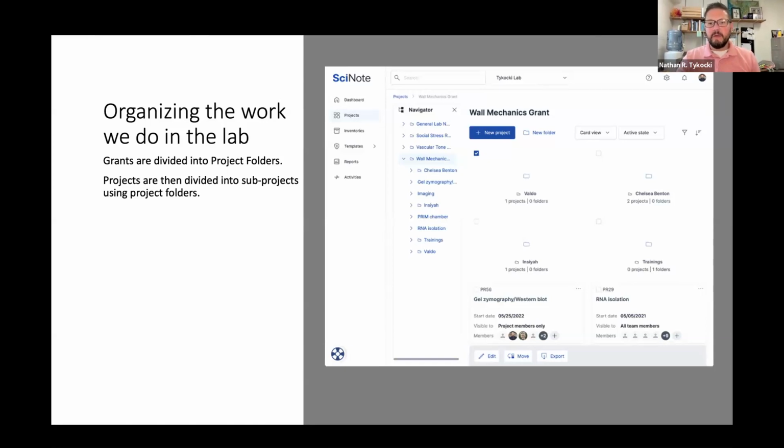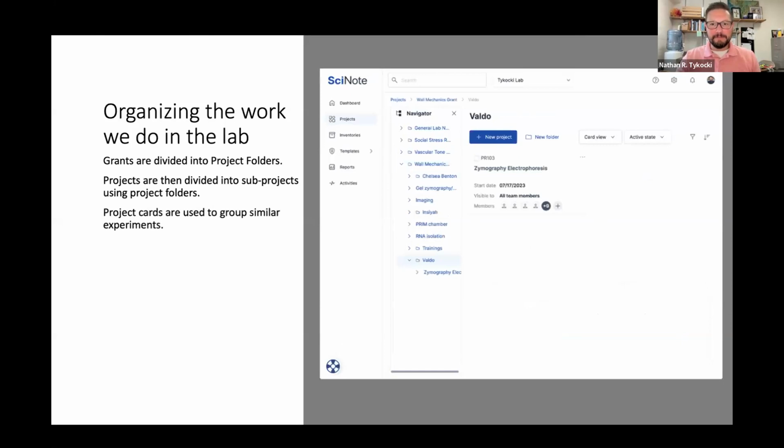And you can see at the bottom, what we do use pretty commonly is this ability to assign tasks and projects to different people. This has been something we've used extensively to be able to track people's work on a day-to-day, week-to-week, month-to-month basis, and also to know where to pick up when things are left off, as, being in an academic setting, students that aren't graduate students are in constant flux, coming and going and coming and going. And that way we know how to keep them all together.